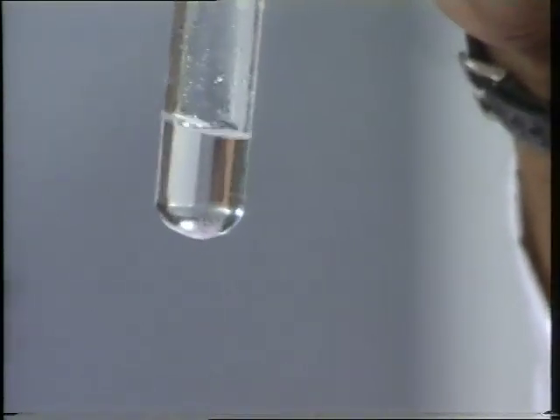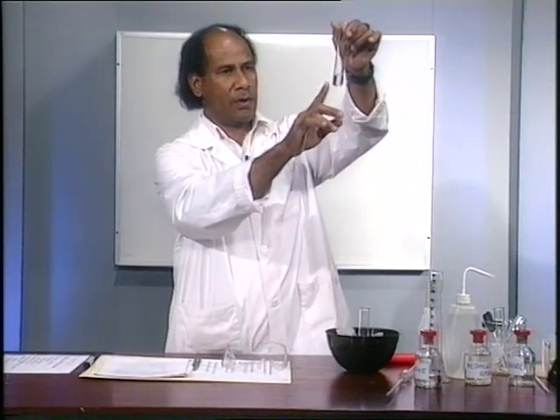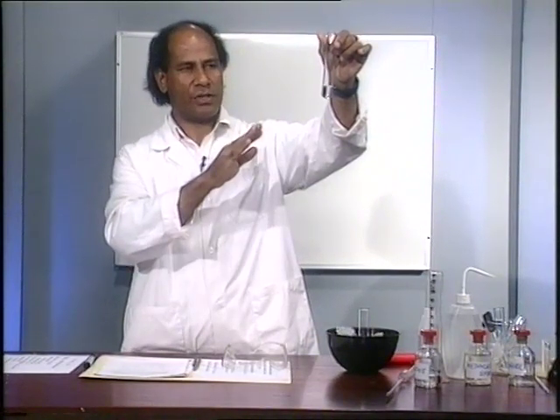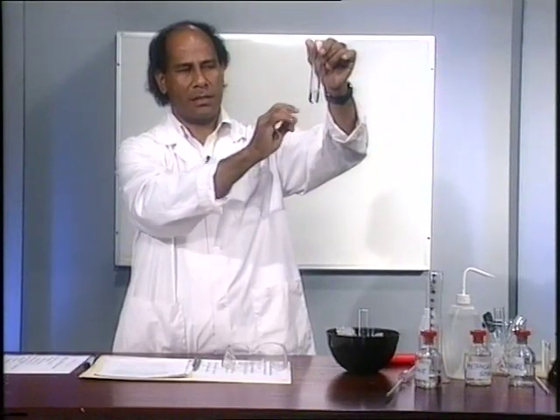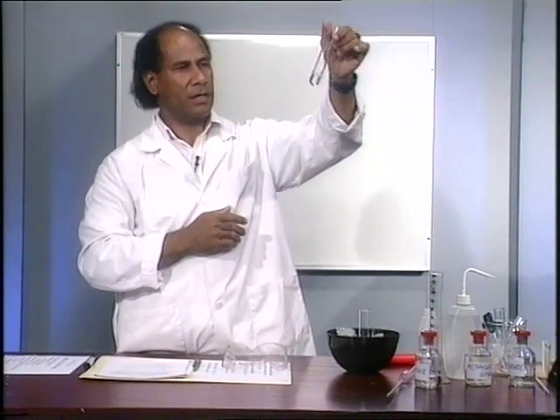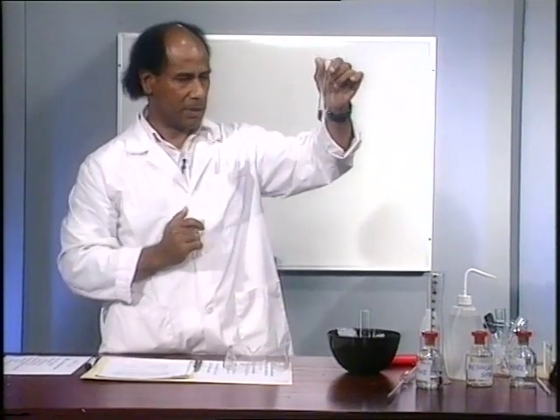Okay, so I think you have seen what's happening. Now, you should be able to note down your observations and then try and relate this observation to hydrogen bonding. Is there any hydrogen bonding in this solution? Right, if there is, what is the effect of that? Or if it is not there, why is the solid initially floating and then coming down?